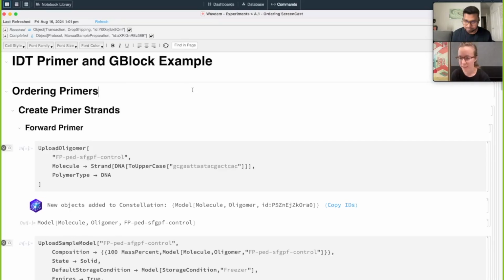Can I jump in? Absolutely. One of the things that I think is surprising to folks who are accustomed to working in person is just how much this particular cloud lab system knows about every single sample in your inventory. Emerald tracks the chemical composition of every liquid you have, and every single different little drop of liquid has a sample ID. Because of this, the system is able to reason about chemistry and what happens when you mix things, which is cool.